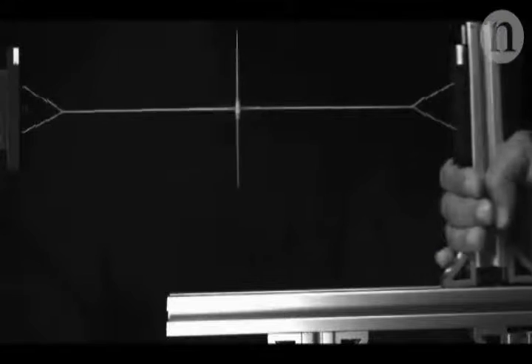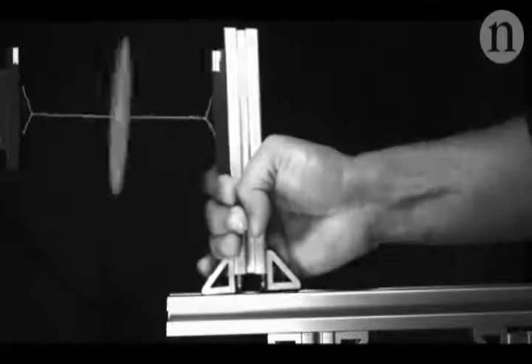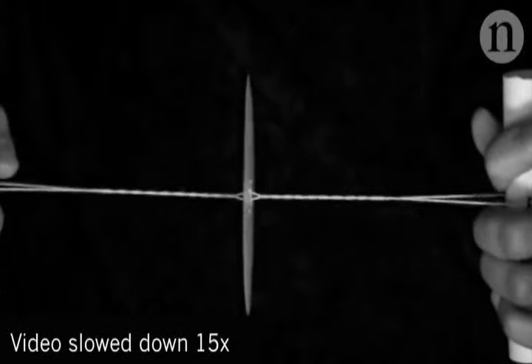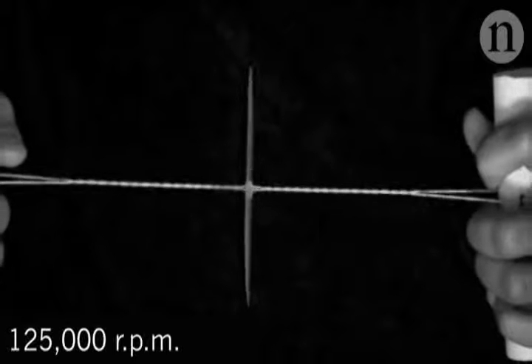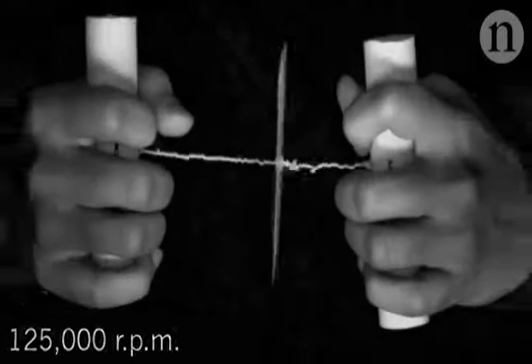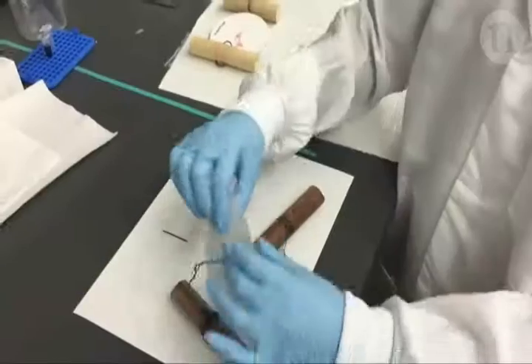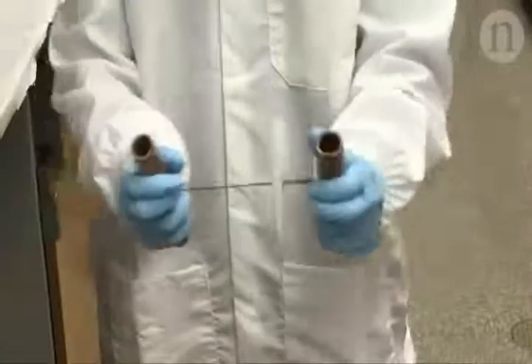They studied the mechanics of the toy to work out how to achieve the fastest possible spin. The final design can spin at 125,000 revolutions per minute, which is over 2,000 spins a second. Just 90 seconds of spinning is enough to separate a blood sample into red and white blood cells, platelets and plasma.